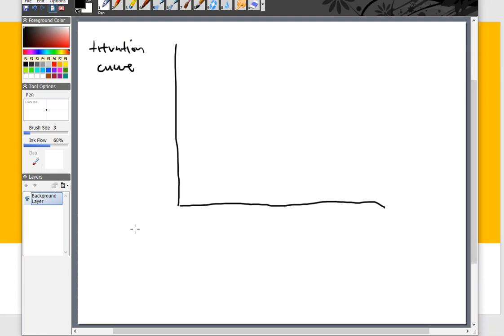All right, and we're going to start talking about, okay, well, here's my flask, and let's say that that flask has an acid on the inside of it. And I'll put a pH probe down in there. What pH am I going to have? Is it going to be lower than 7 or higher than 7? Well, I hope that you told me lower than 7 because it's an acid, folks. There's an acid there. The pH is going to report there's an acid there.